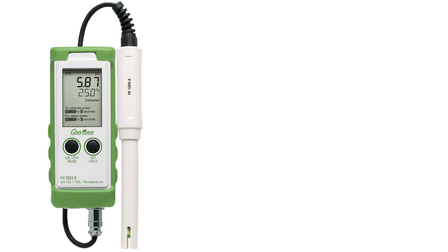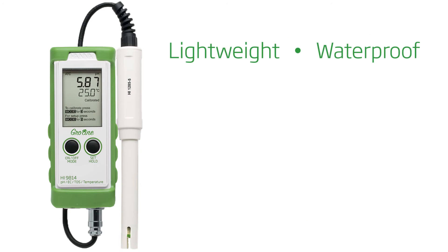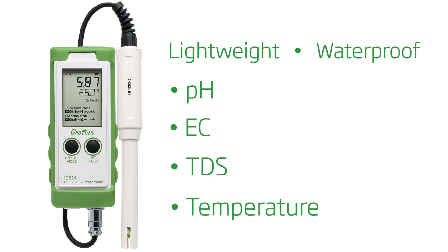The HI9814 is a lightweight and waterproof portable meter that measures pH, conductivity, total dissolved solids, and temperature with a single amplified probe.